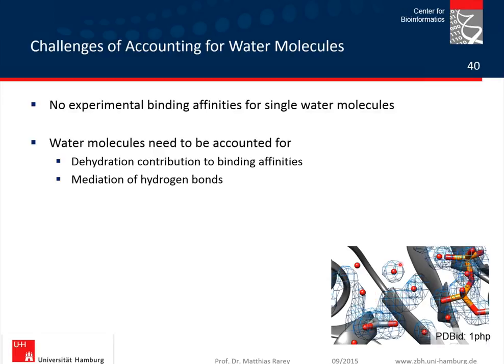But they are not. There's a water molecule like this one here, which is clearly resolved in the structure. So this has a clear position, seems to be somehow fixed in the crystal structure. There are water molecules like this one over here, where you basically have no electron density support at all. So this water is more or less modeled at this place because it maybe makes nice hydrogen bonds or whatever, but certainly not because there was electron density.